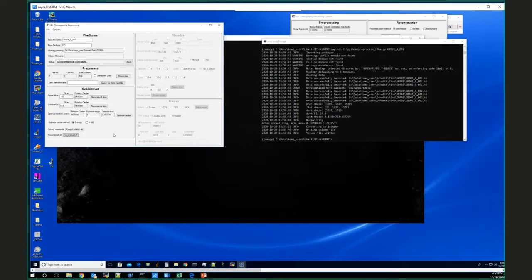Chris, because I just work at the synchrotron and I don't have a lab machine, I'm always interested in knowing how the competition's doing. We don't want to be doing the same thing you can do on a commercial machine. We should be doing things that you can only do at a synchrotron. Certainly one of those is the high speed. If we were doing the pink beam for dynamics, that's something only the synchrotron can do. If you're just doing it to collect the data more quickly, that's not a really good reason to use the synchrotron, unless it lets you do 1,000 samples, which wouldn't be feasible at all on a lab machine.